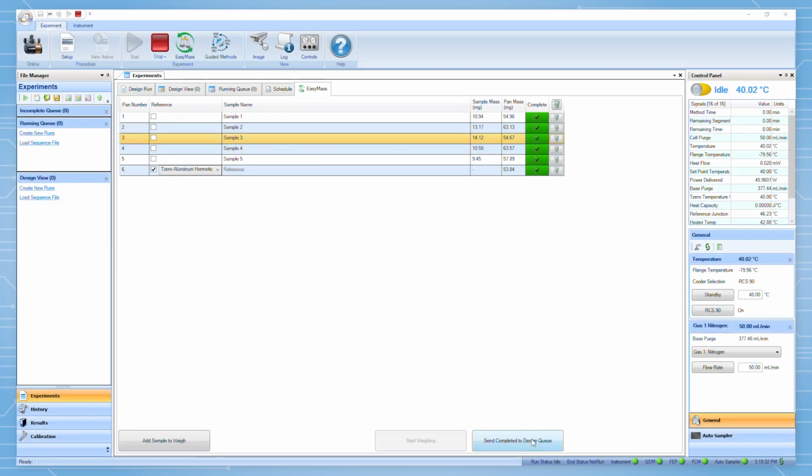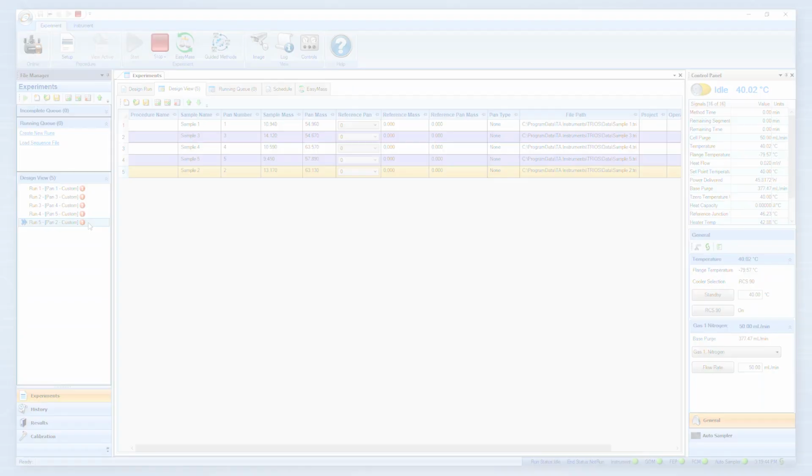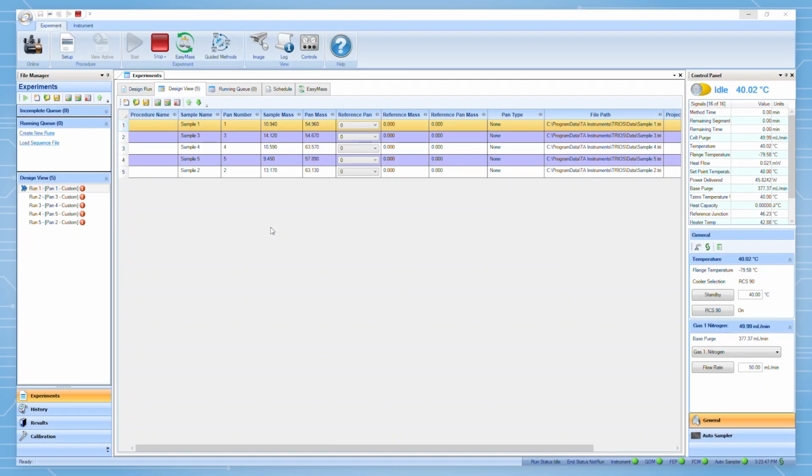When you're ready, click Send Completed to Design View. This will create a run for each completed sample entry row in the EasyMass table with the mass filled in. Any reference entries will instead be loaded into the reference tray configuration, ready to be selected as the reference pan for a run. From here, just finish filling in the rest of the run information as normal.